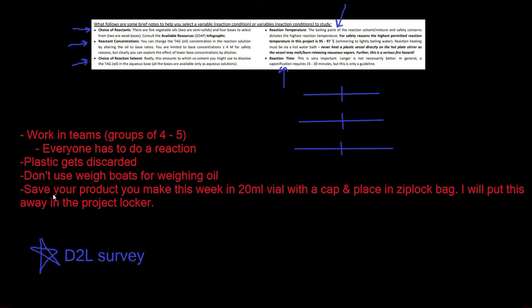And at the end of tomorrow, or whenever you do the lab, you're going to want to save your product, so save your soap in a 20 ml vial with a cap on it. Place that in a Ziploc bag, and I will put this in the project locker for you, so that way you can get it next time.